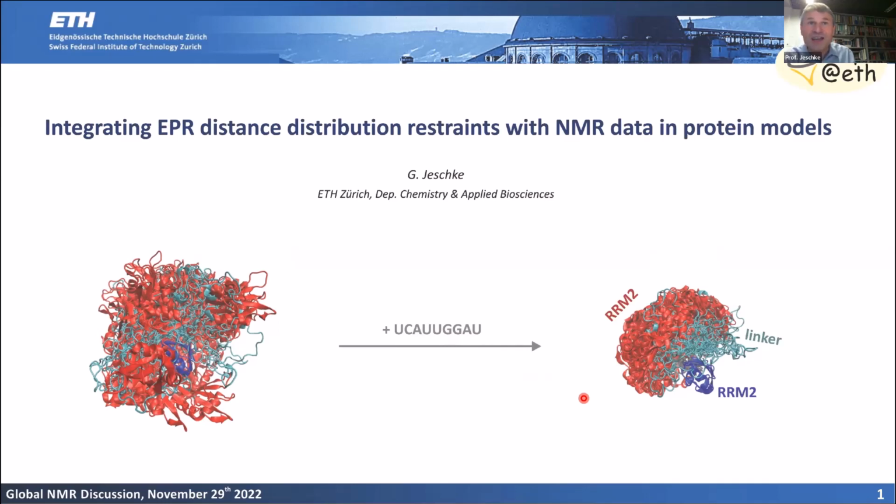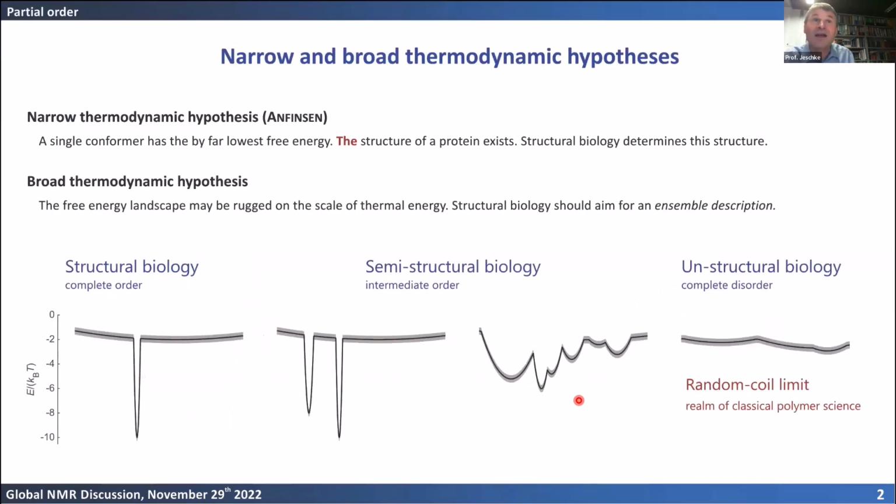Before I do this, I want to explain why we want to do this at all, and why we need to combine EPR and NMR data for doing things like that. Let me start from the very beginning.